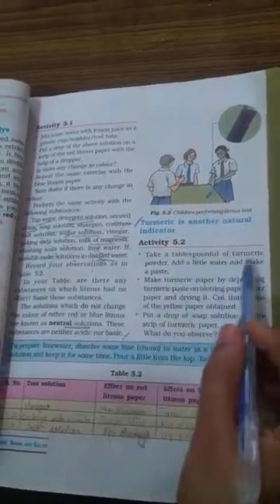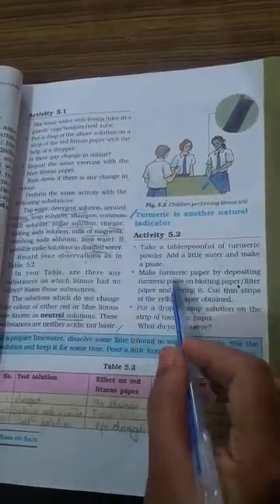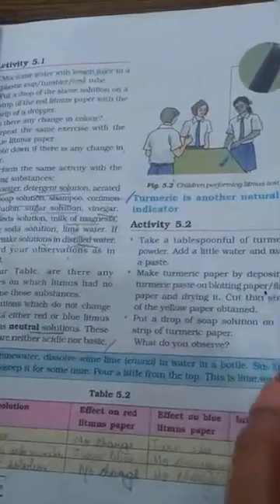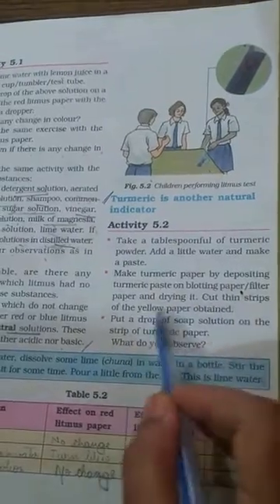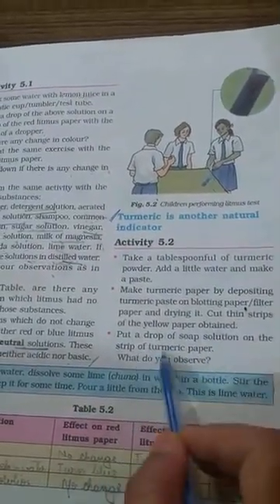Take a tablespoon of turmeric powder, add a little water and make a paste. Make turmeric paper by depositing turmeric paste on blotting paper, filter paper and drying it. Cut thin strips of the yellow paper obtained. Put a drop of soap solution on that strip of turmeric paper.